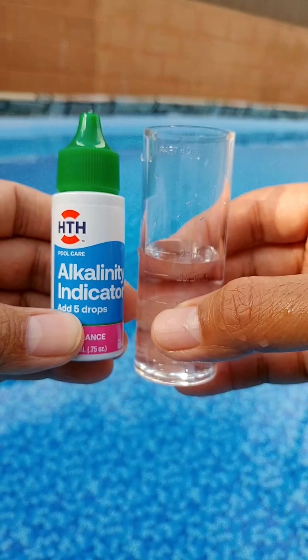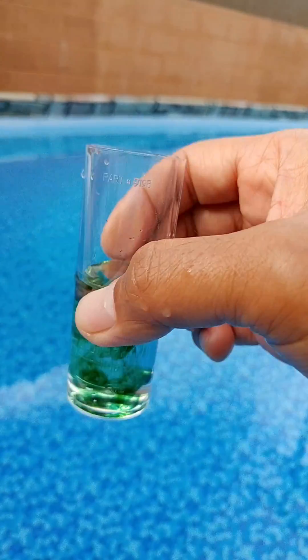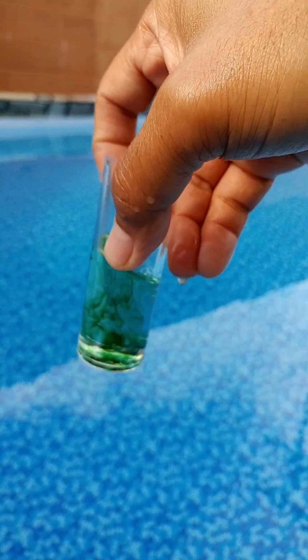Step 2: Add 5 drops of alkalinity indicator while swirling to mix. Your water sample should turn green.